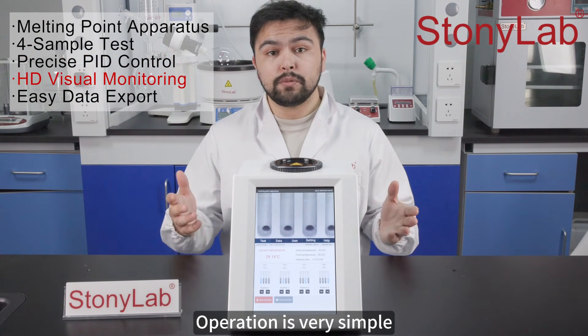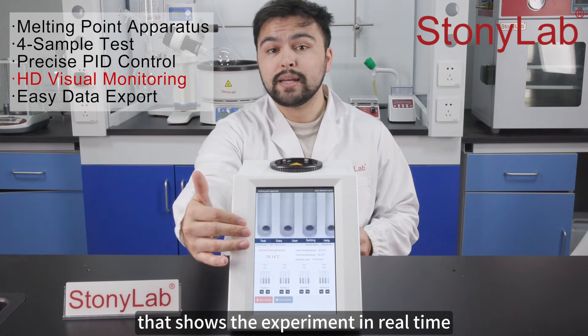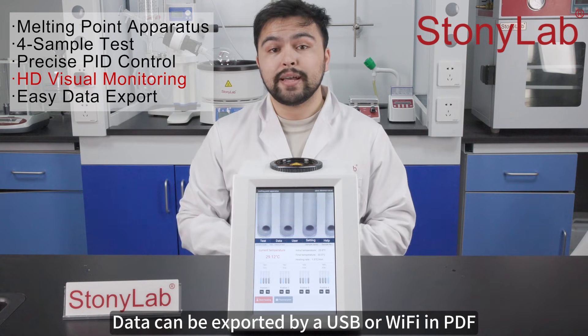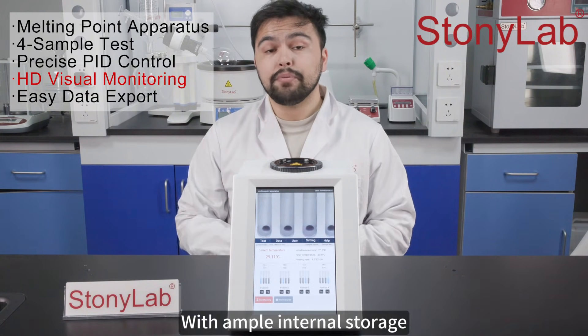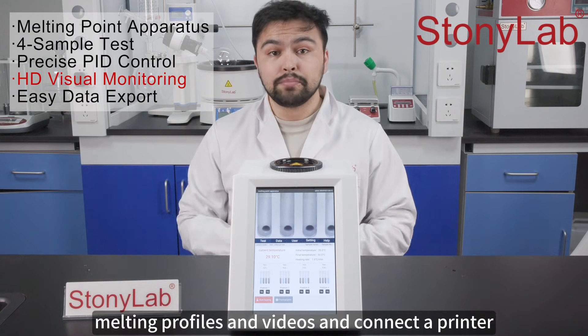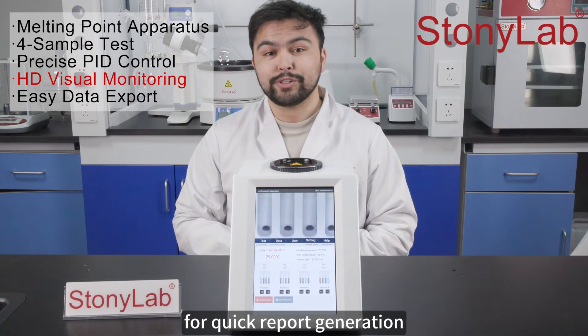Operation is very simple with a high-definition touchscreen that shows the experiment in real time, and data can be exported via USB or Wi-Fi in PDF or Excel format. With ample internal storage, you can save experimental methods, melting profiles, and videos, and connect a printer for quick report generation.